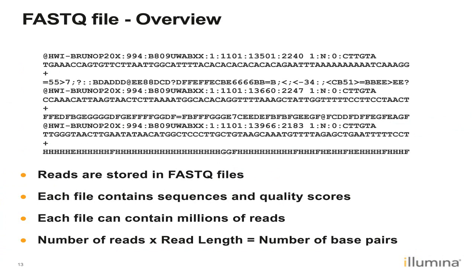All right, so FASTQ files. You hear a lot about them. They're typically the input for any and all analysis downstream. So here on the top, I have a snippet of what a FASTQ file looks like. Here I'm actually just showing 3 reads.